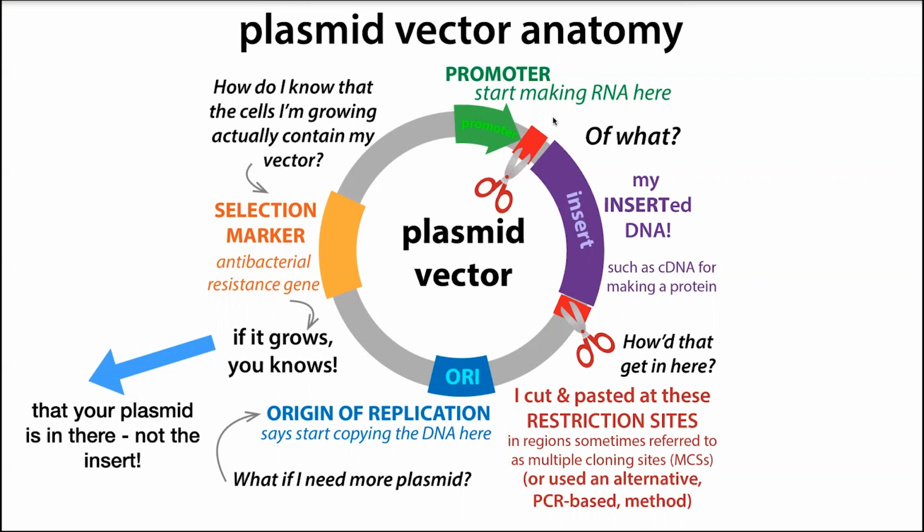And it's going to be combined with this vector backbone. This vector backbone is going to be kind of generic. There are different ones, like pET vectors and pUC vectors and various vectors. But different researchers will use the same vector backbone with different inserts. And it's often this insert region that we really care about when we're doing this sequencing.